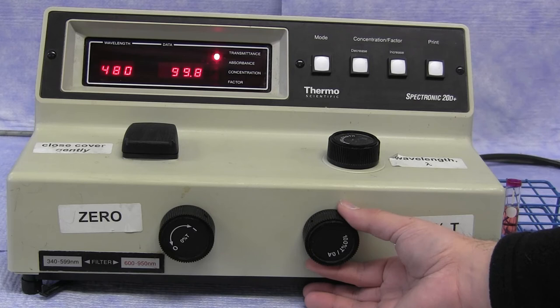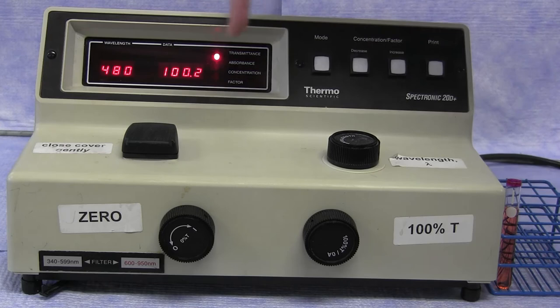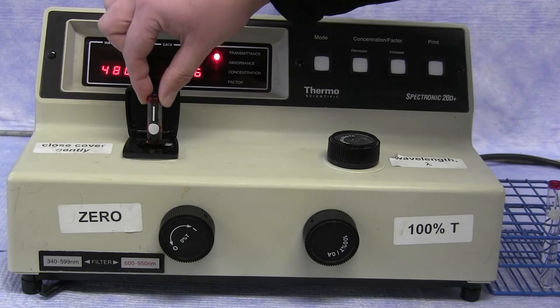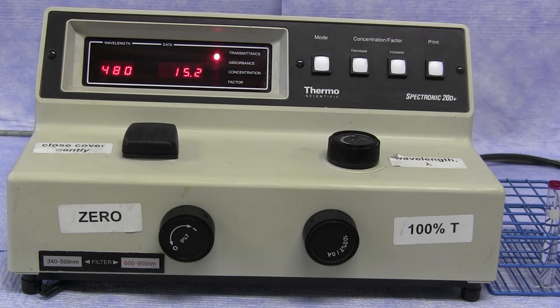There is usually a small amount of drift associated with the actual value. So plus or minus 0.2 for the calibration and measurements is acceptable. You can then remove your solvent cuvette and place your sample cuvette inside, again making sure that the markings are lined up on the spectrophotometer. When this is done, you can then record the percent transmittance of this particular sample. The percent transmittance can then be converted into an absorbance for you to either determine concentration or molar absorptivity.